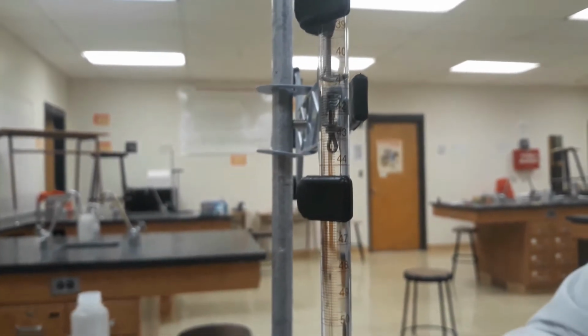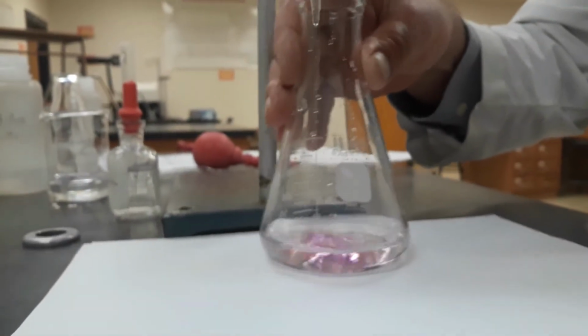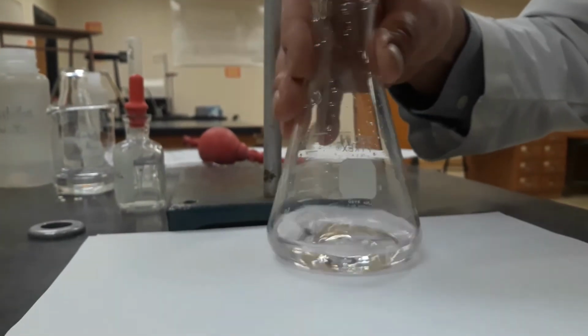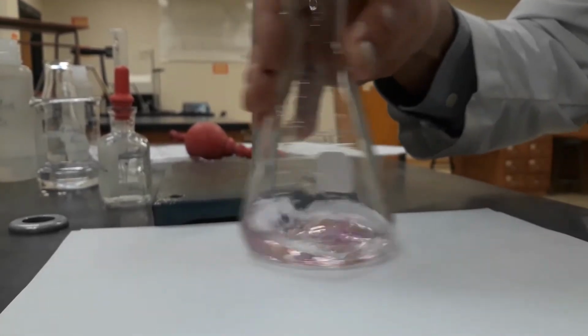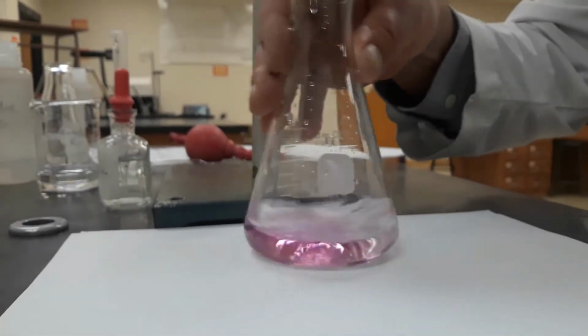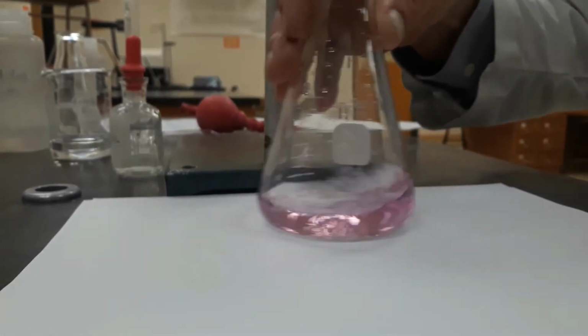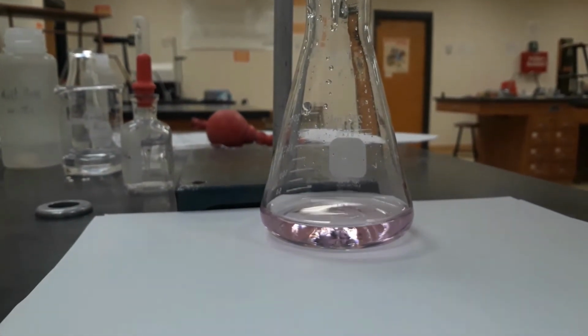It's going to be right in the mix of that clamp, making it kind of hard to see. Whoa, slow down there, cup. And there's your final reading.